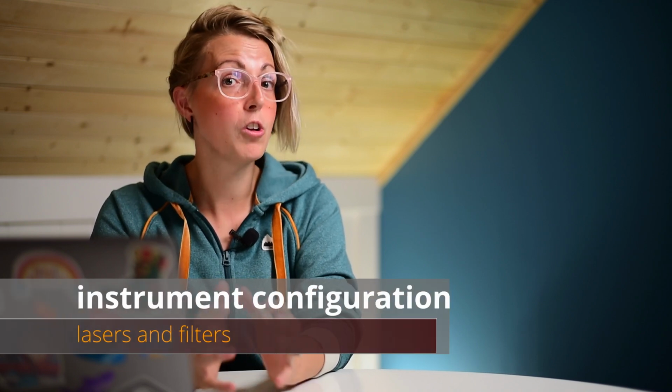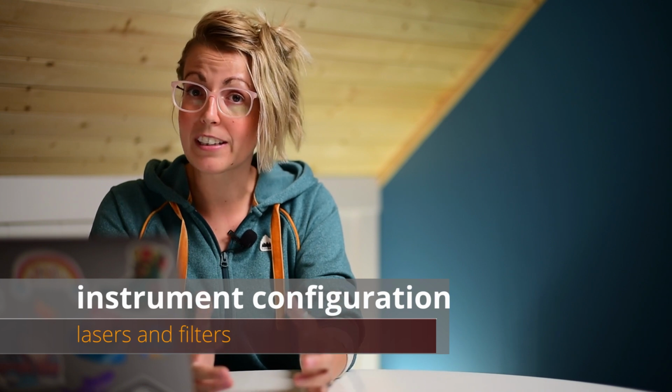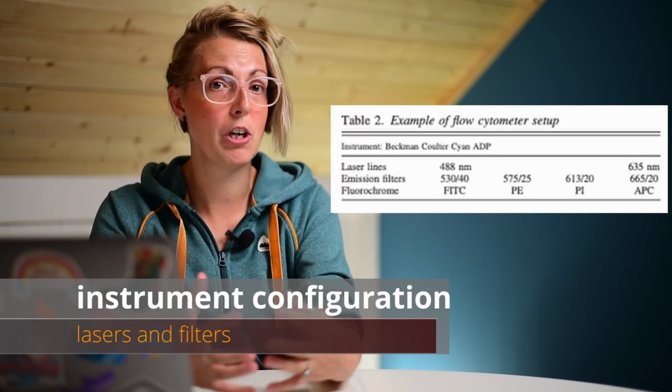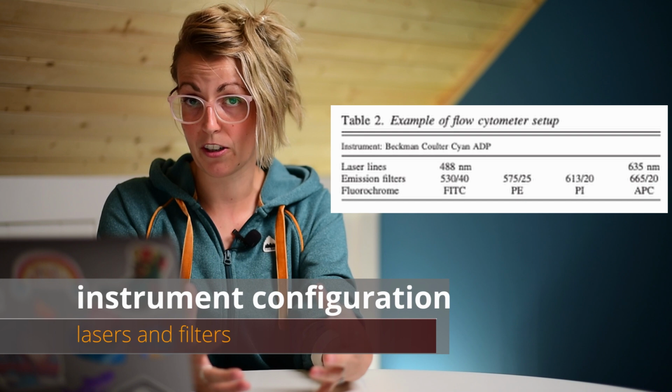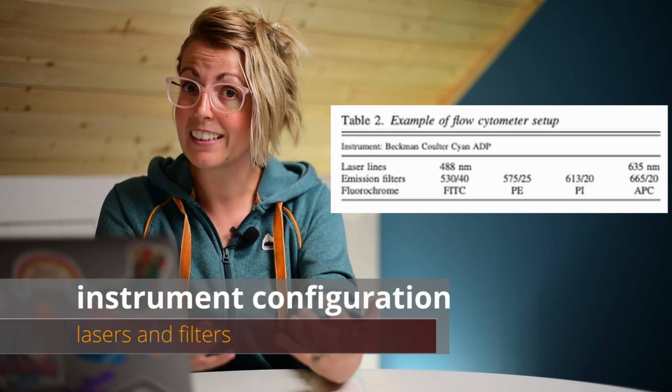Again, the optical configuration of an instrument will have a large bearing on how that data can be interpreted. So it's important that when you're reading a paper, you not only know what instrument it was acquired on, but also the lasers and the filters that were used, as this can greatly determine the efficiency of the signal capture.